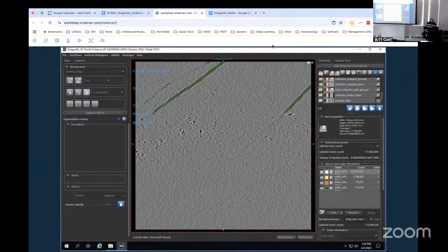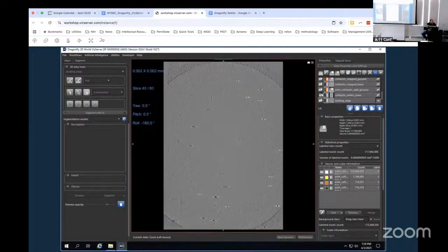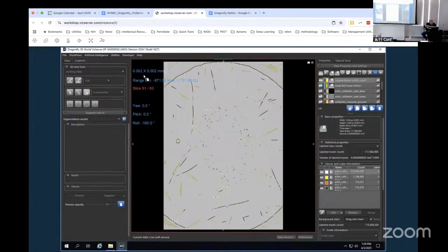Now, I thought I had the non-cleaned version, but apparently I don't. Let's try to do this. Yeah. Sorry, I got off track there.